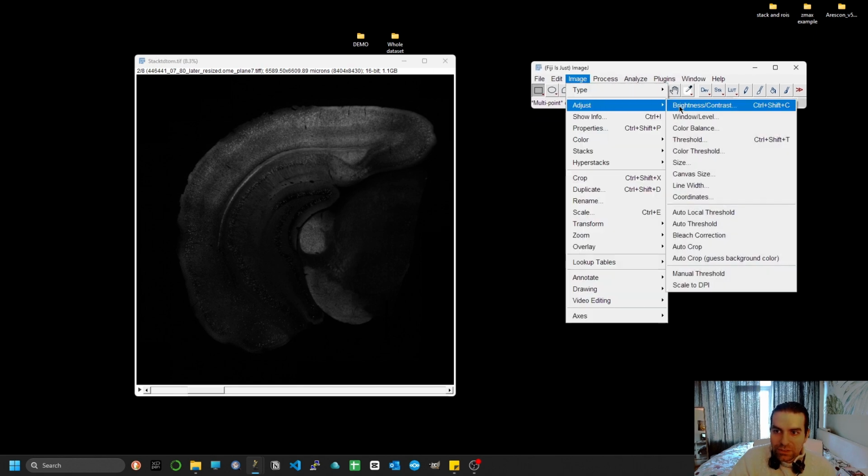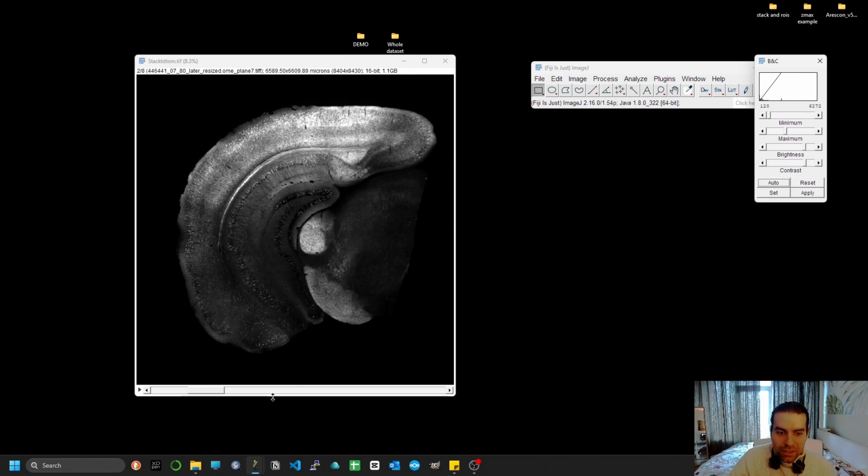So if I go adjust brightness, you see that we have the same part of tissue and its image across slightly different focal points. Now this doesn't really mean that we're having a 3D representation of a brain, as we do, for instance, when we're doing brain clearing and we go across many different Z-planes. In this case, it's just a few Z-planes.